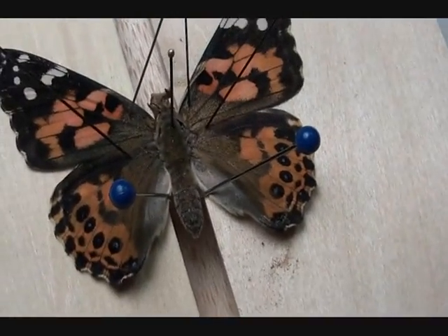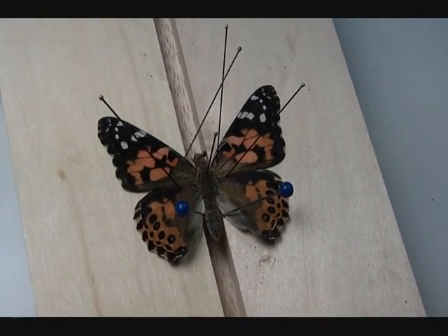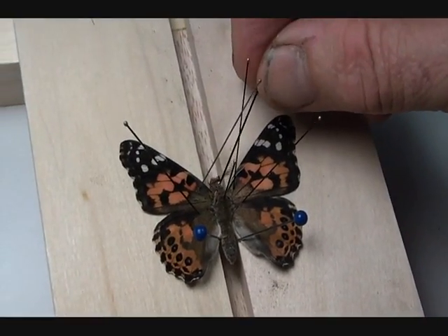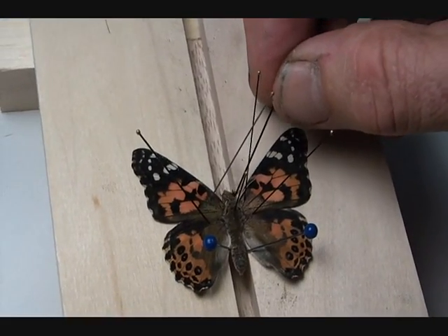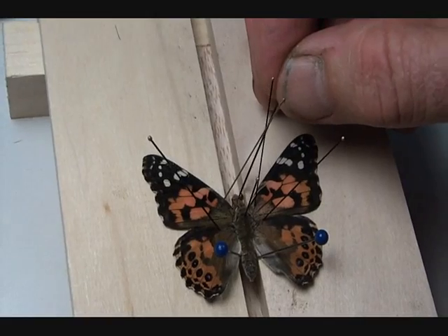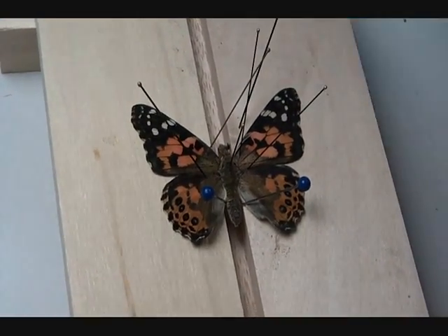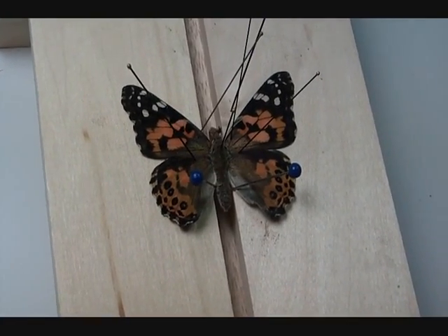The only other thing you might want to do is bring out the antennae. We deliberately picked a slightly defective specimen here, and his antennae are not visible — I think they got all curled up. But you can bring those up and pin them out nicely.